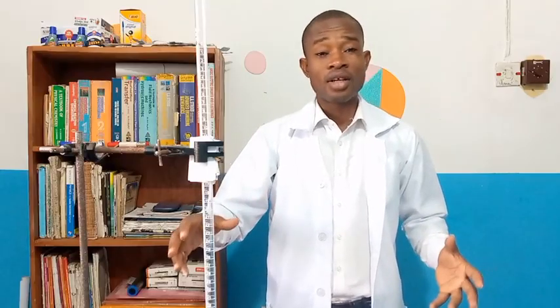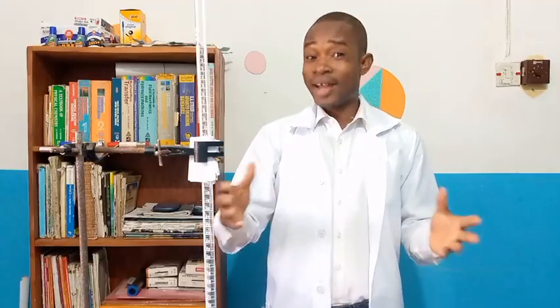And then the iron(II) sulfate, that is our ammonium iron(II) sulfate hydrated crystal, is going to serve as our base in this case. We are going to call it the analyte. Are you following? That is ammonium iron(II) sulfate. It is the concentration of that solution that we seek to obtain.